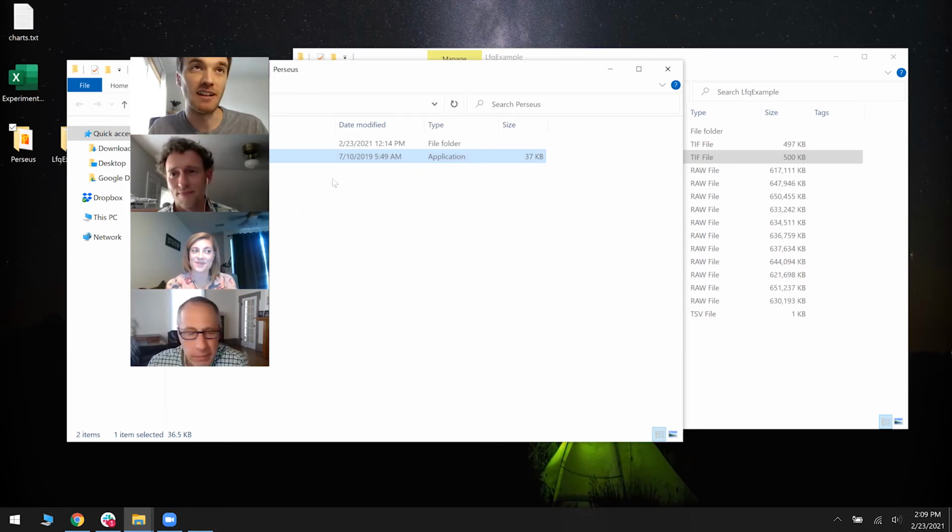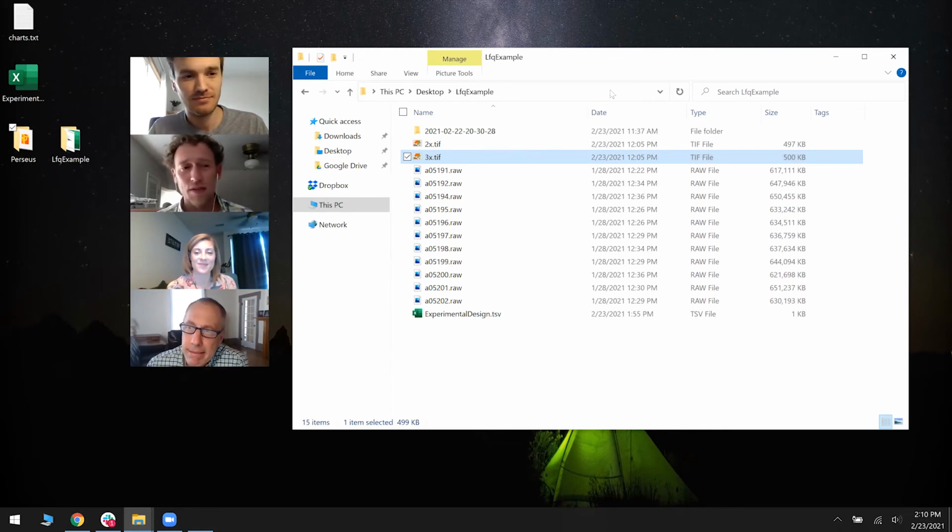I'm going to move on to the next thing, if you have any questions about that? No, I mean, as a person who does a lot of label free, just seeing that it spits out that Excel, or that matrix, I mean, I can do whatever. But I think to people that haven't been around very long, you think that it should just make that. But if you go back even 10 years, PD wasn't around 10 years ago, it wasn't making those graphs or that table. So that alone is just good to know, that that's an output.